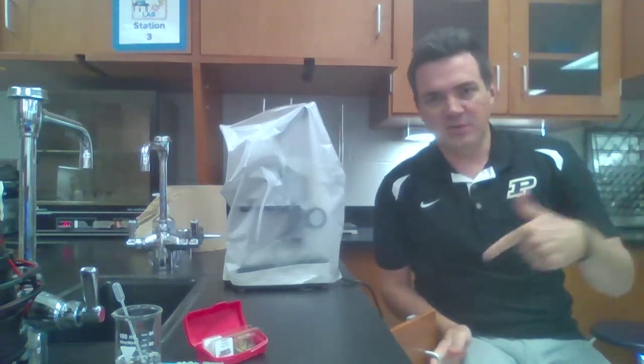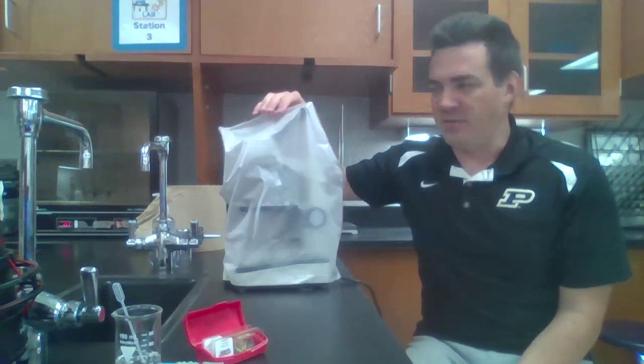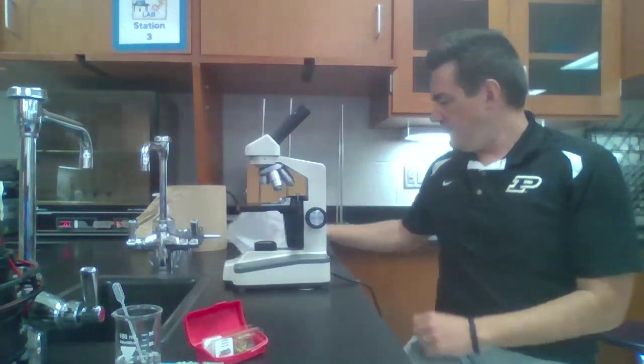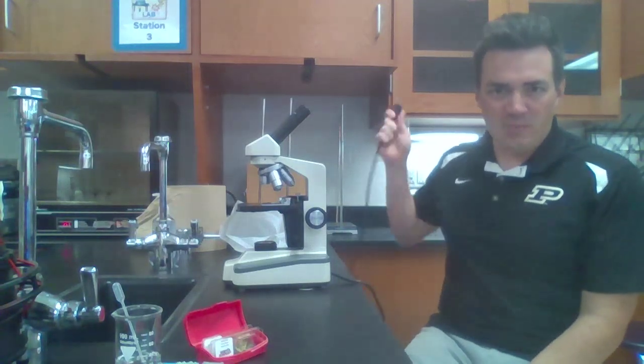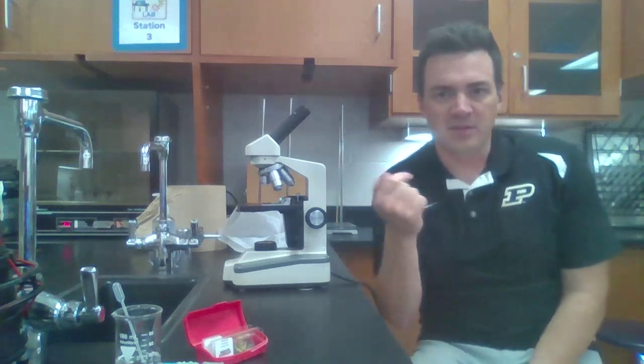First of all, the microscopes are going to be available in one of these upper tall cabinet doors. They're right in there inside of the lab station, so you can get them out there. They should all have a cover on them. So take the cover off, unwind the power cord, get that plugged into one of the outlets. If it doesn't seem to be working, check to make sure that one of the little buttons on the outlet isn't popped out. You'll need to push that back in.